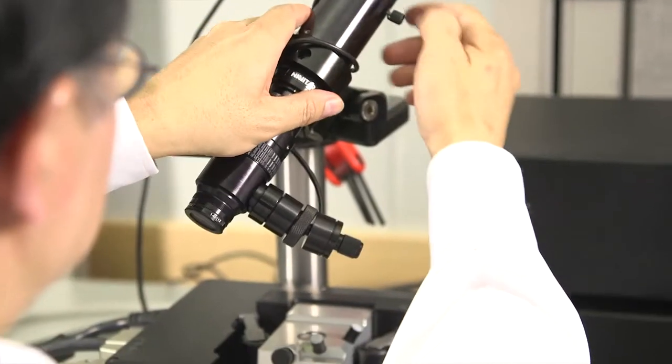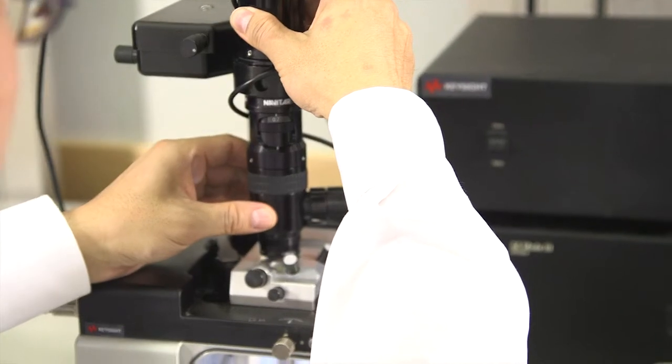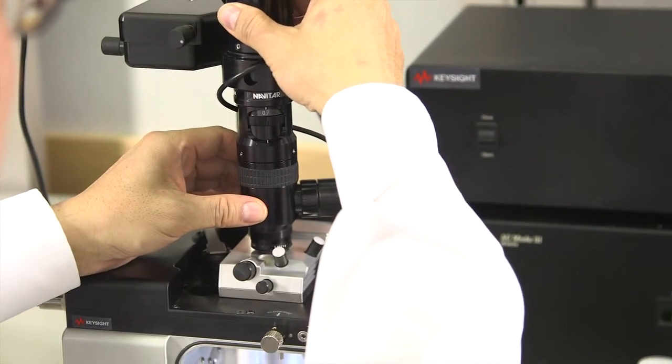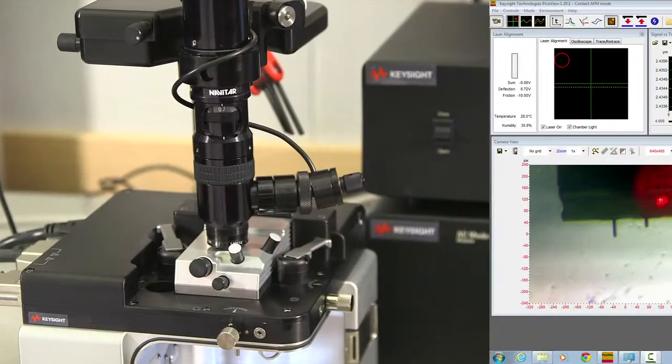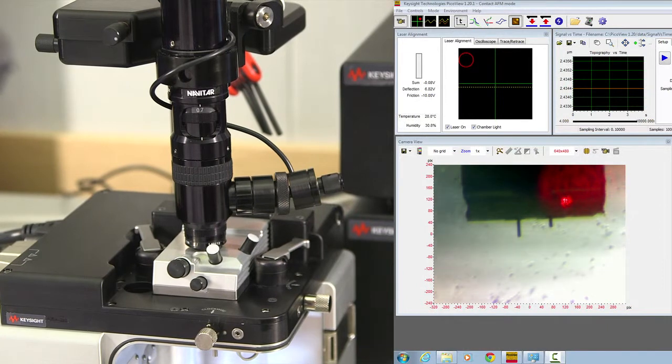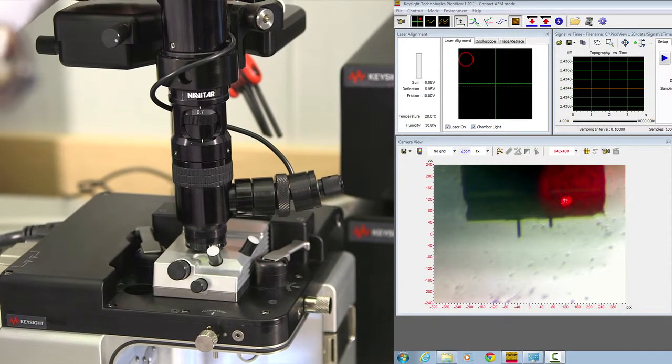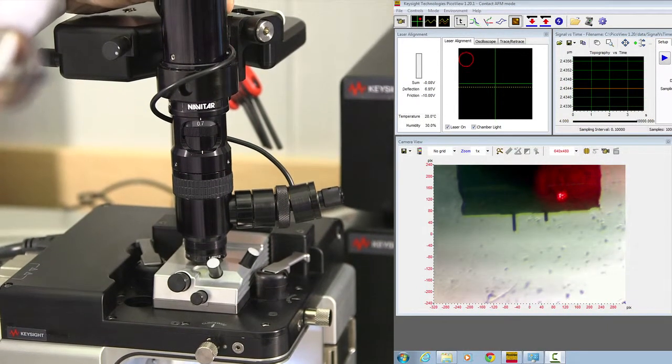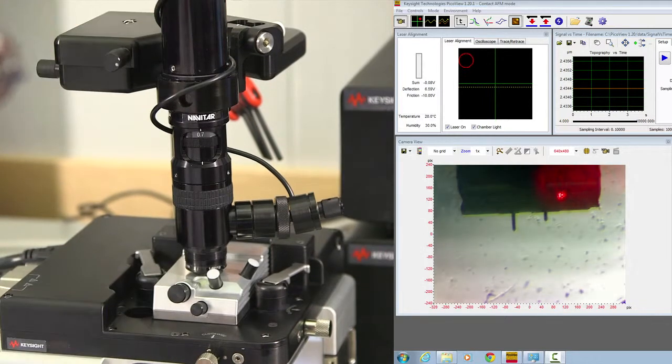Lower the optical microscope so you can see the optical view from the computer. Do the necessary focus so everything is nice and clear.